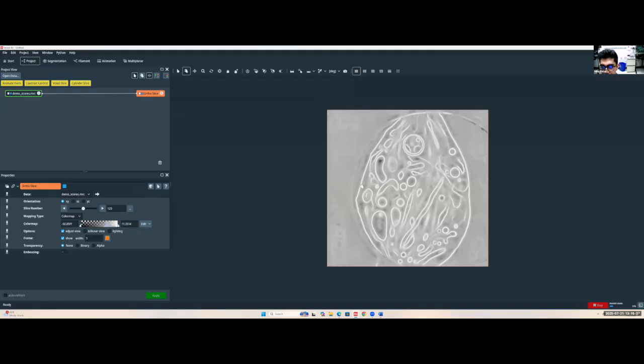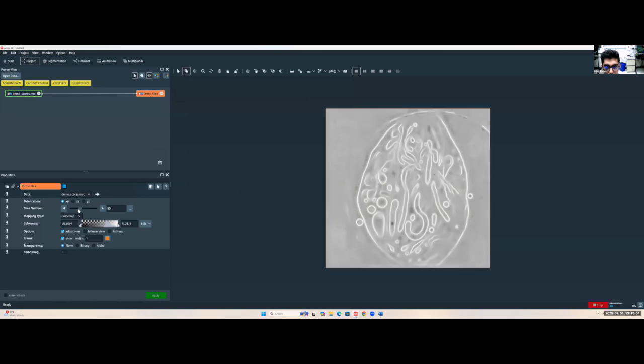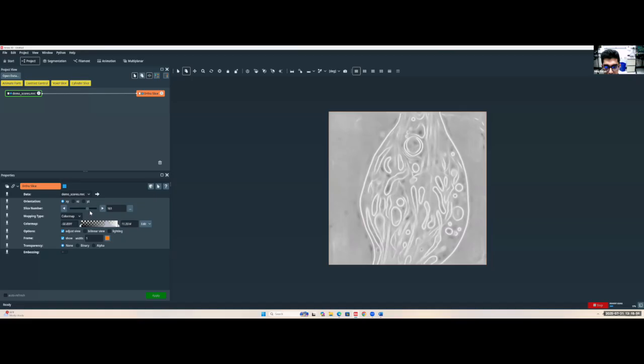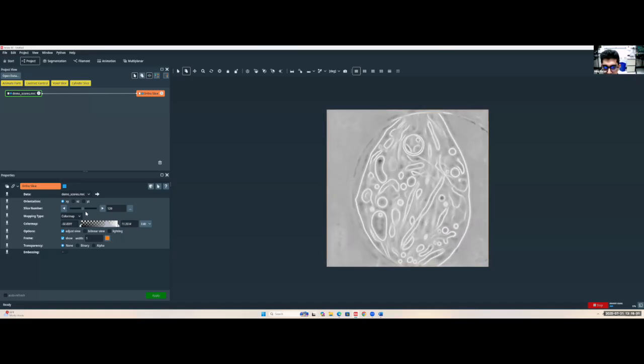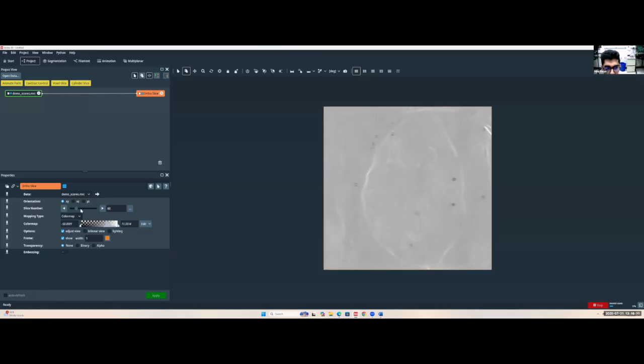And this is our scores file, again, that has come out of membrane. Now that we have this ortho slice selected, our properties panel down here has populated. We're on slice number 125 right now. We can go through our different slices to see different features of this tomogram. And we can see this is really, really rich in ER networks, and we seem to have a cool autophagosome-like structure here, as well as some nice microtubules running through the length of our tomogram.